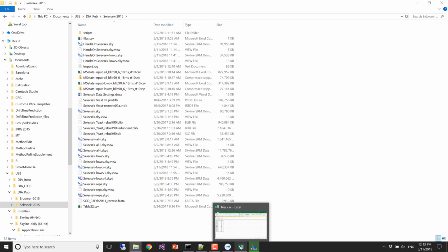And so that's what that step is. It's like, okay, we're going to do replicate measurements, and then we're going to see what we can measure reproducibly. We did replicate measurements over a day, so 24 hours. So we're assuming that probably the person who did them wasn't pulling new sample out of the freezer for every measurement, which means that there's some time where the peptides could be degrading. If methionine oxidation was a problem, then it might show up.